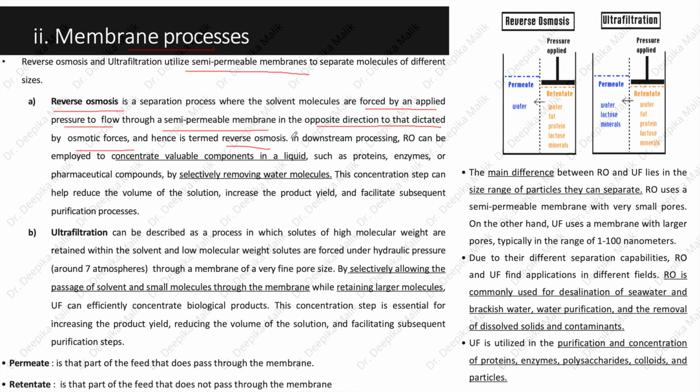In downstream processing, reverse osmosis can be employed to concentrate valuable components in liquid, such as proteins, enzymes, or pharmaceutical compounds by selectively removing water molecules. This concentration step can help reduce the volume of the solution, increase the product yield, and facilitate subsequent purification processes.